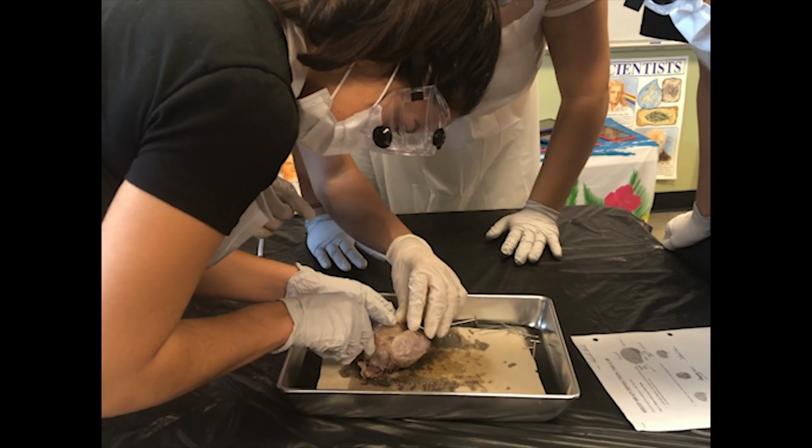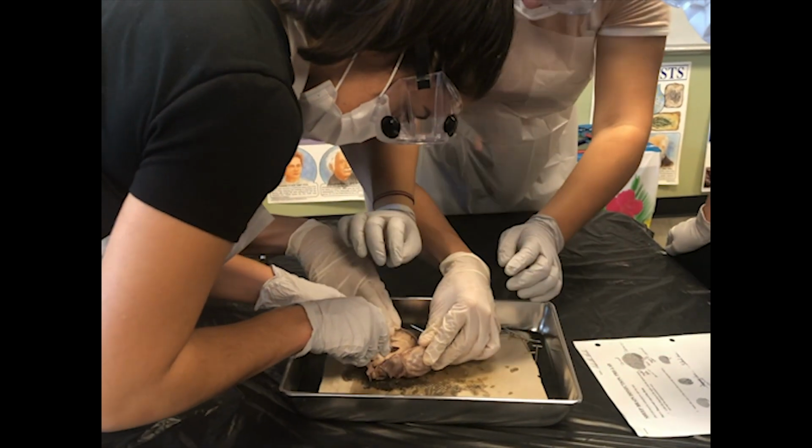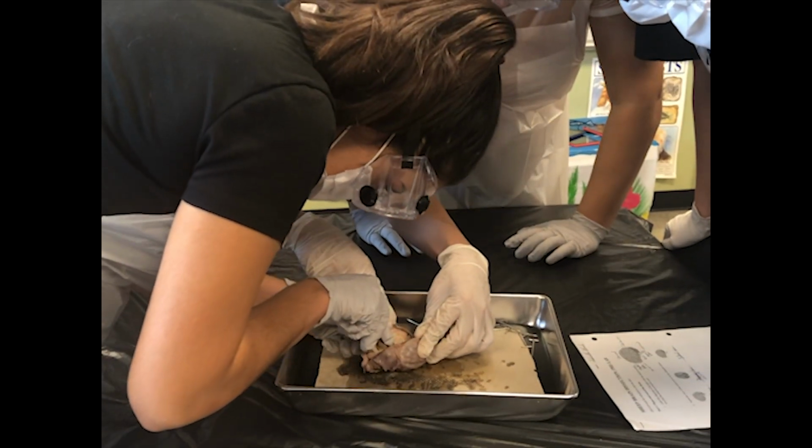Wait, hold up. And then you have to cut all the way to the... Wait, no. Cut, yeah, like all the way down. There you go. We got it, sir.